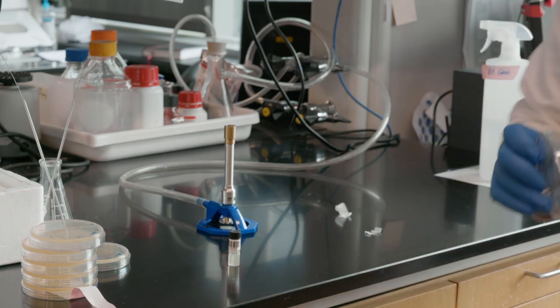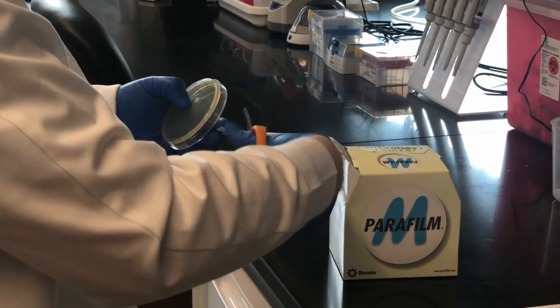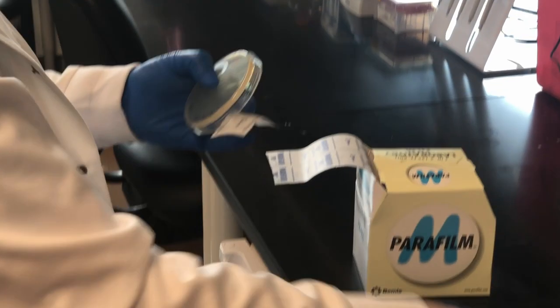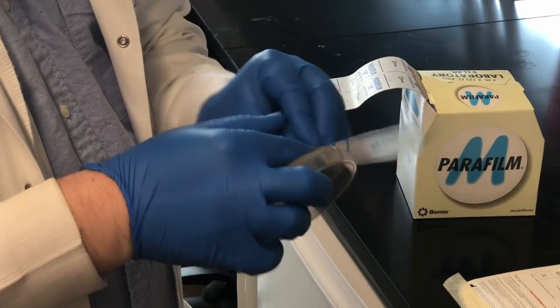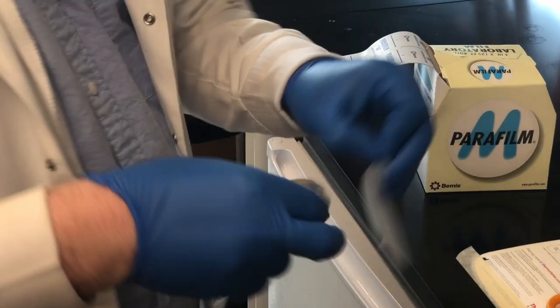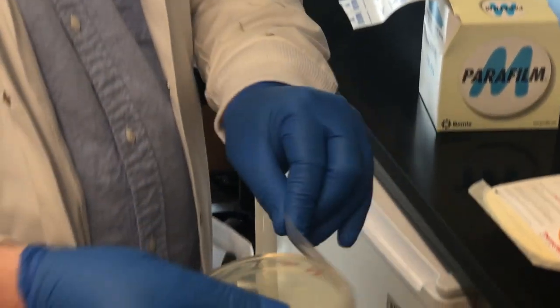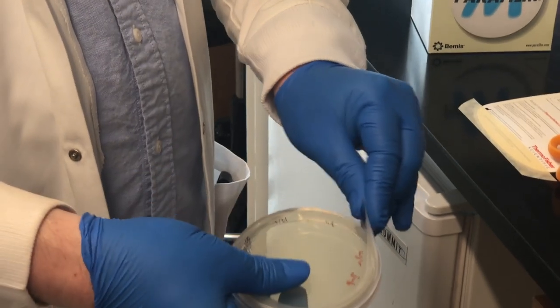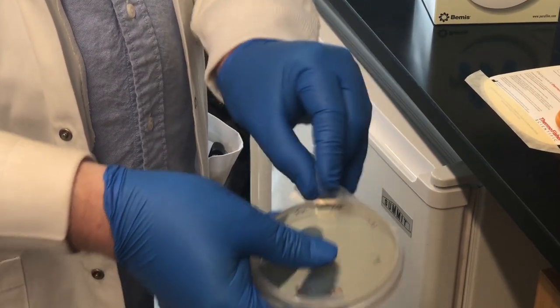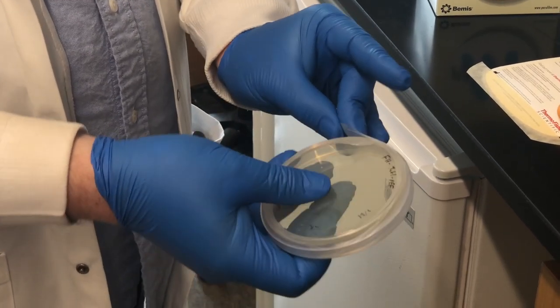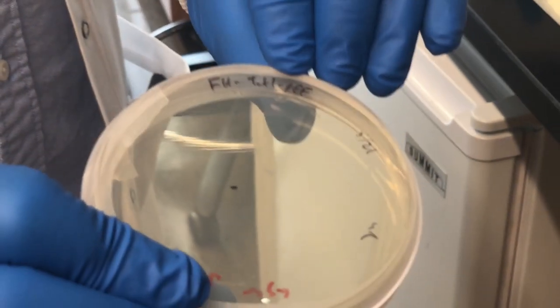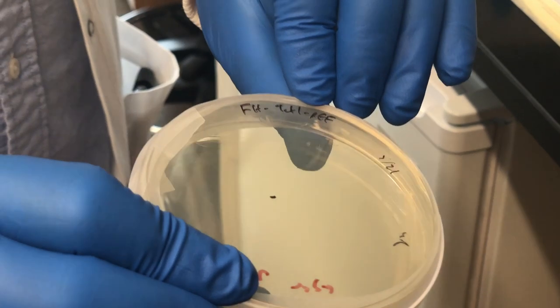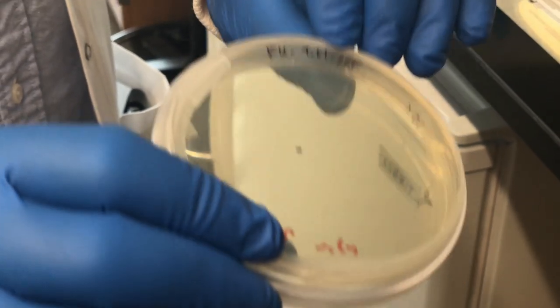Before we do that, we just want to maintain sterility by sealing this up with Parafilm strips. This just gets wrapped all the way around the edge here. And if you look just right, you might be able to see some of the streaks in the wire loop on the gel.